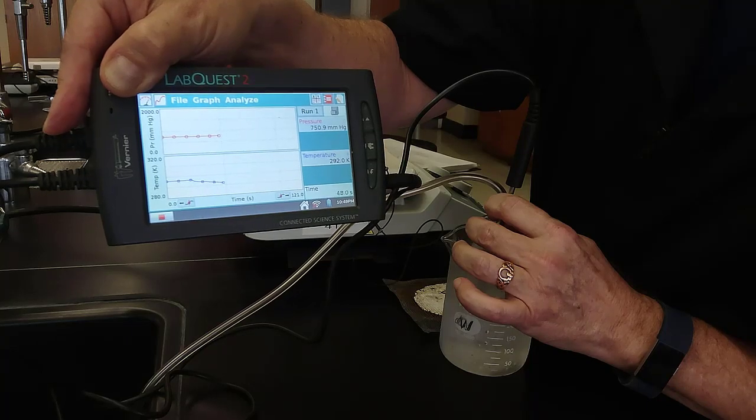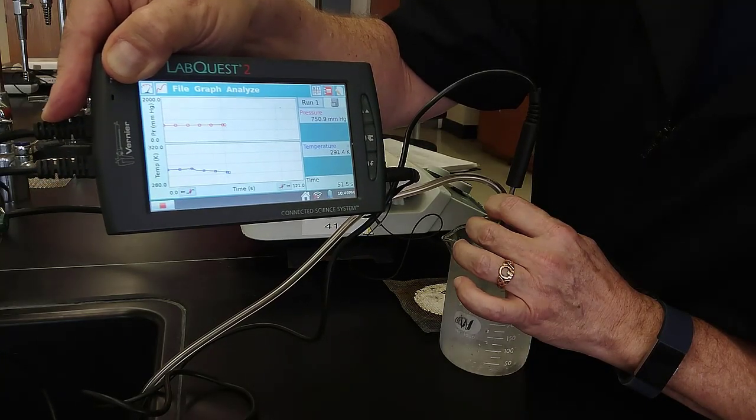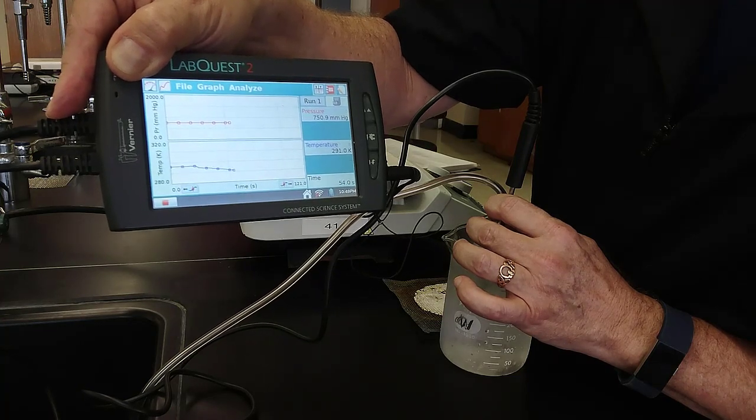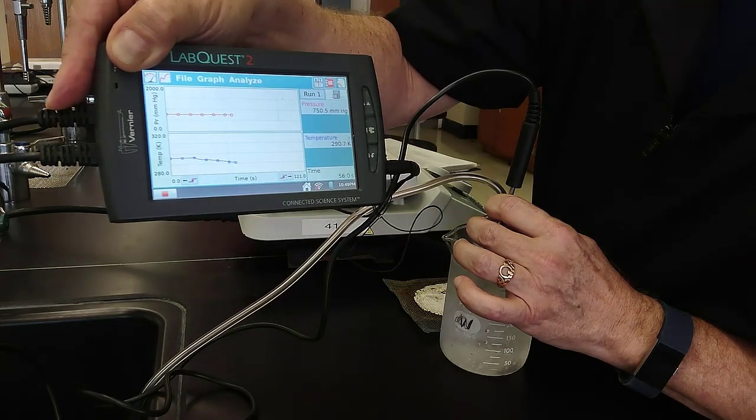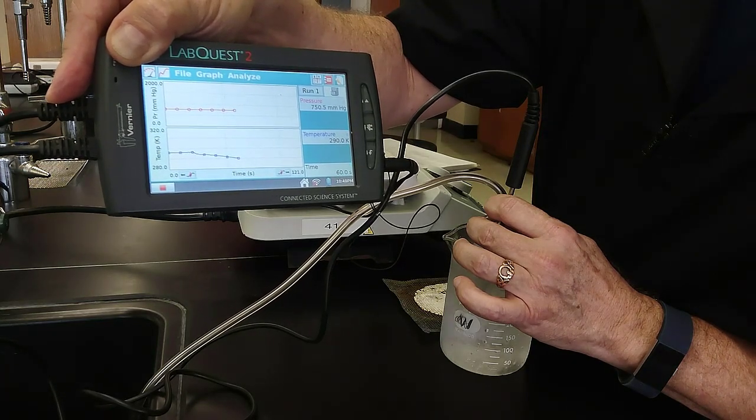And my pressure is dropping, but only minimally so far. We're at 750.5, we were at 750.9, and we're dropping.